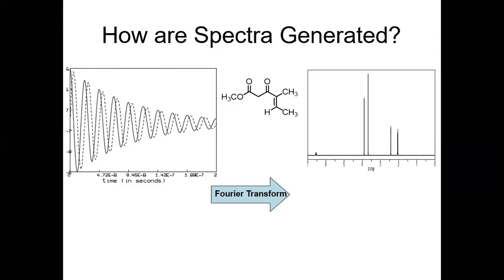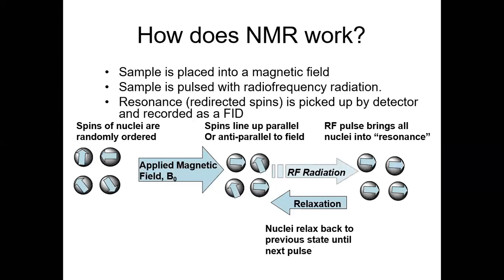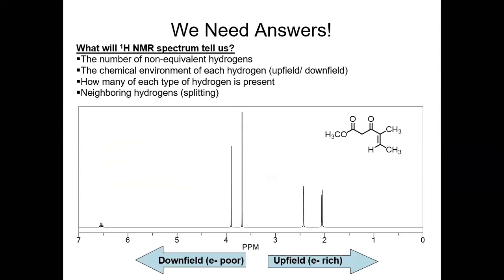All right, so let's go back to here. I want to ask a question. How many signals are in this spectrum? Not lines, because some signals are one line, some are two lines, some are multiple lines. But how many signals are there? Five. One here.